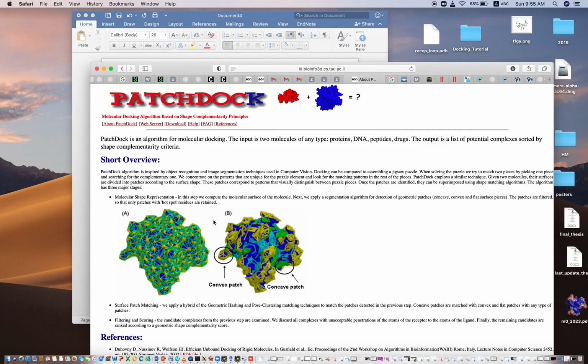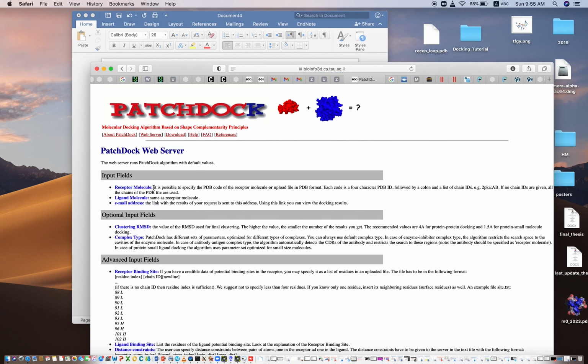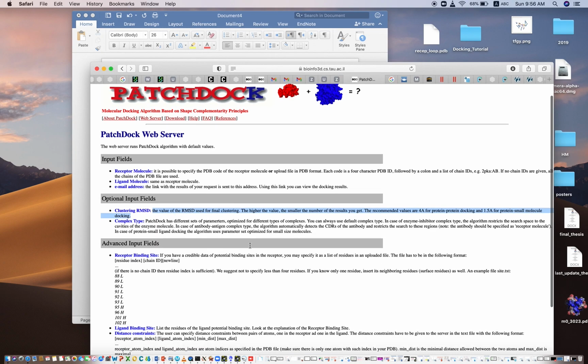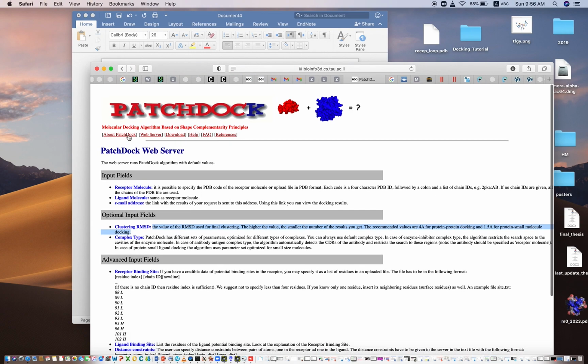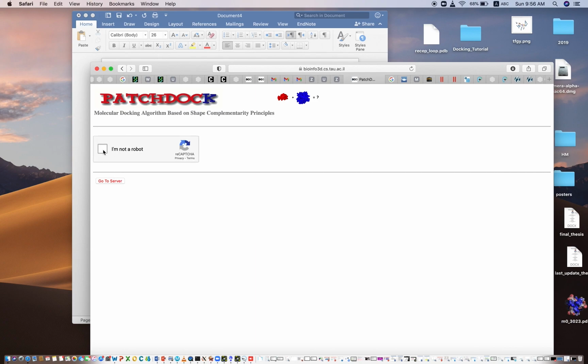So in this way PatchDock works. You can click over here on help, and all the information about the receptor molecule, ligand, and clustering RMSD, as I have talked about, is available in the help. So we are clicking on the web server again.